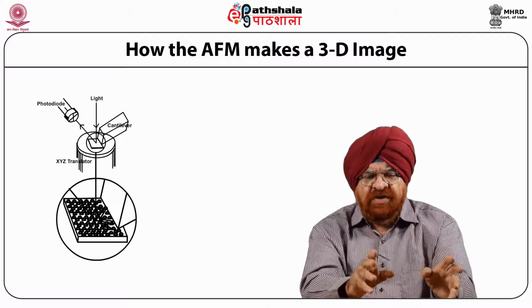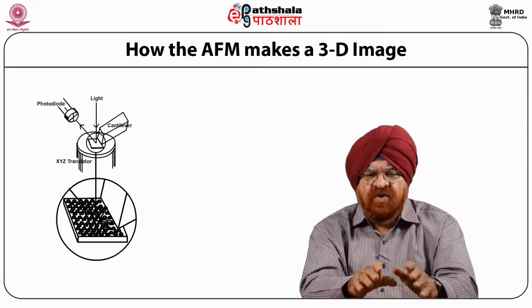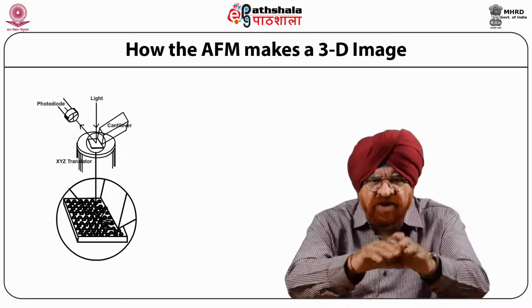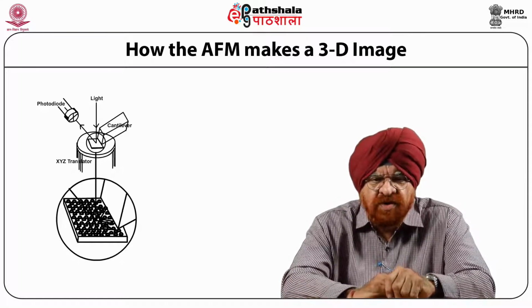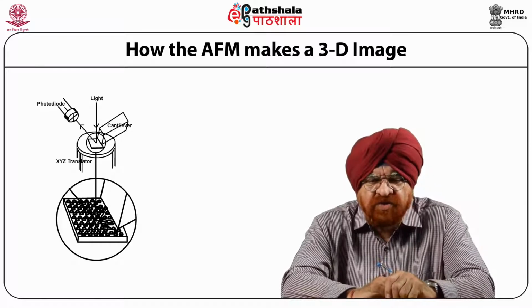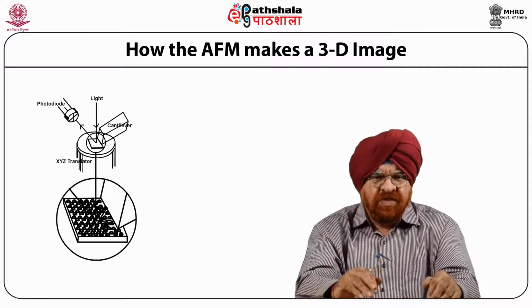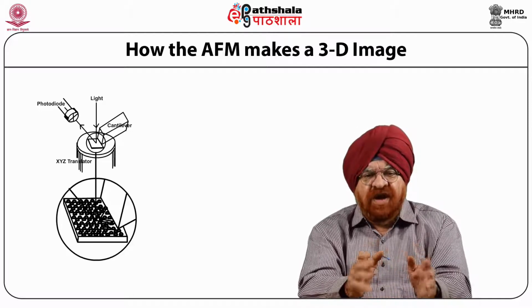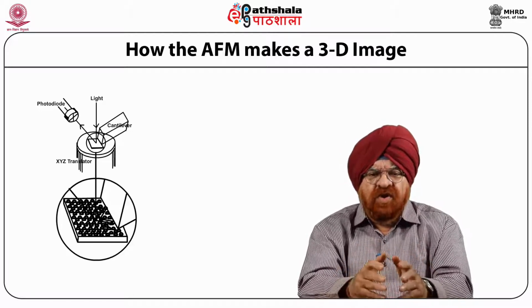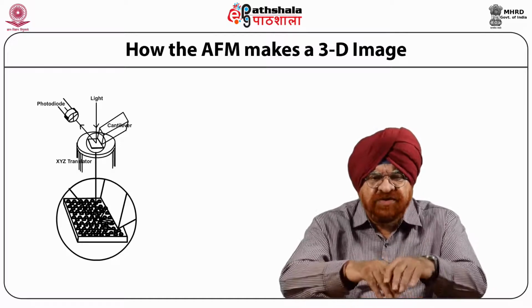Using dual magnification, the AFM combines the wide field view of a scanning electron microscope, SEM, with vertical resolution which exceeds that of the transmission electron microscope, that is called TEM, and is very widely used in the area of corrosion research. The ratio of the vertical to horizontal magnification can be very large, 1000 or more, to allow easy recognition of differences between very smooth surfaces.